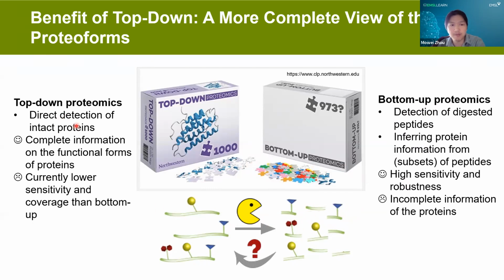For top-down, we bypass the digestion steps, so we directly look at intact proteins. I really like this picture from Northwestern to give you a high-level idea of the difference and the benefit of combining both top-down and bottom-up. With top-down, you really get the high-level view of the proteins.